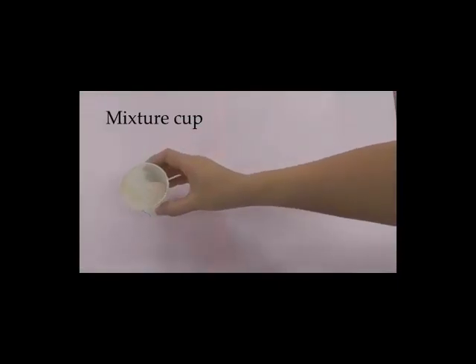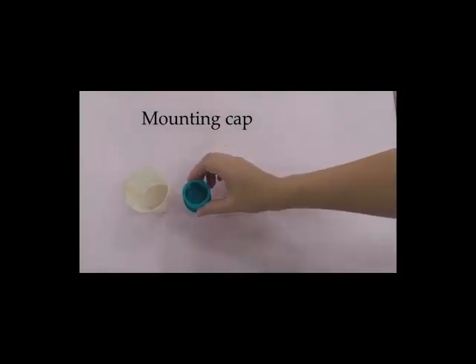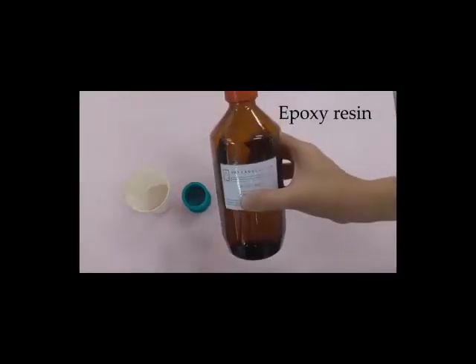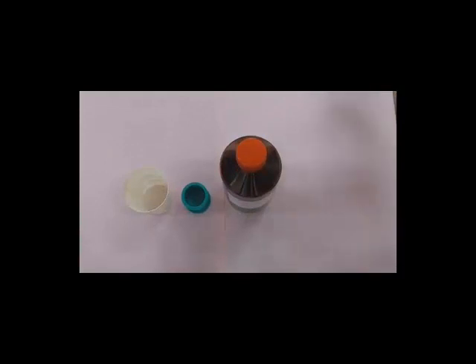Mixture cup. Mounting cap. Epoxy resin. Hardener.